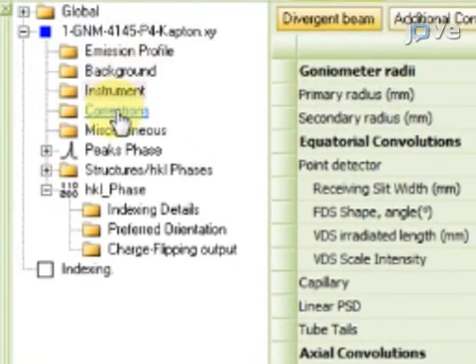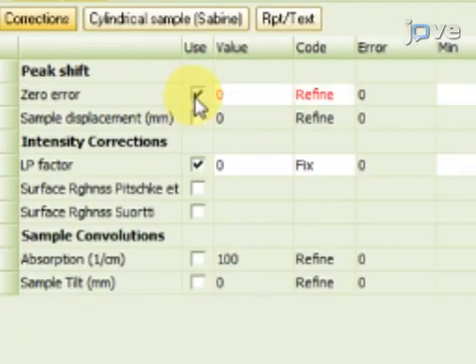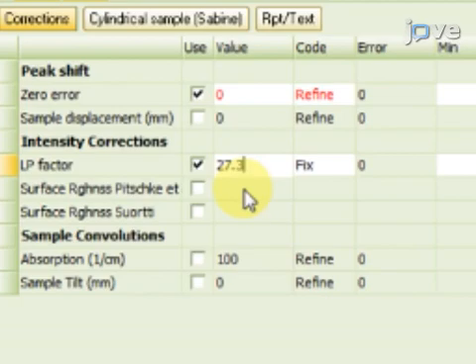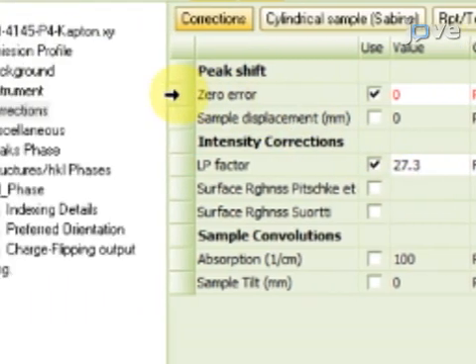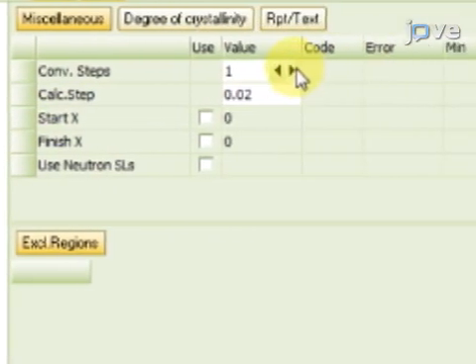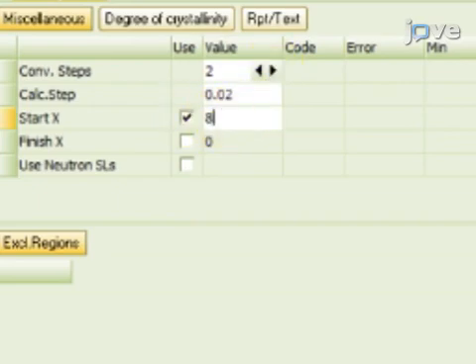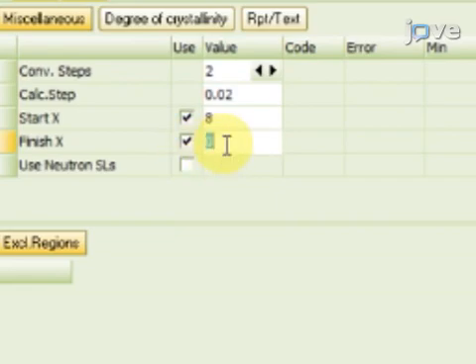Now click Corrections and choose Zero Error. Choose LP Factor and set the value to 27.3. Then click Miscellaneous and set Convolution Steps to 2. Select Start X and set the value to 8. Then choose Finish X and set the value to 75.